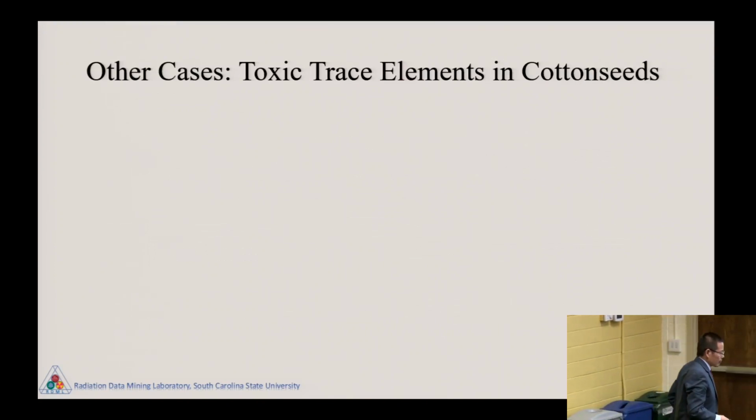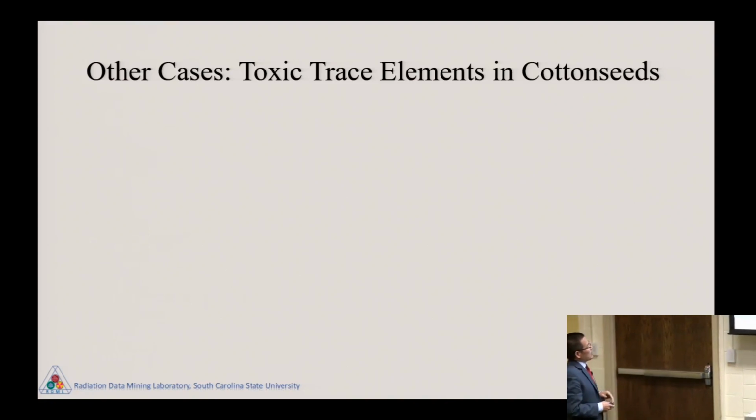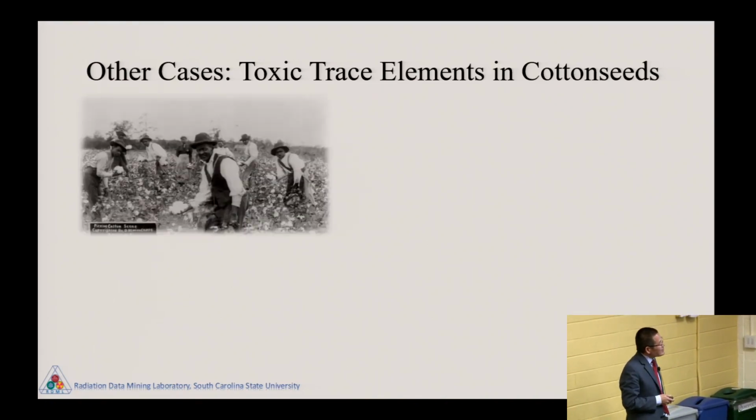Okay. This is the case of neutron activation analysis. Our group is also doing other cases. For example, this one, the toxic trace elements in cotton seeds. This is a very old picture, dated 1872. And there are Black slaves working in the cotton field to pick the cotton.